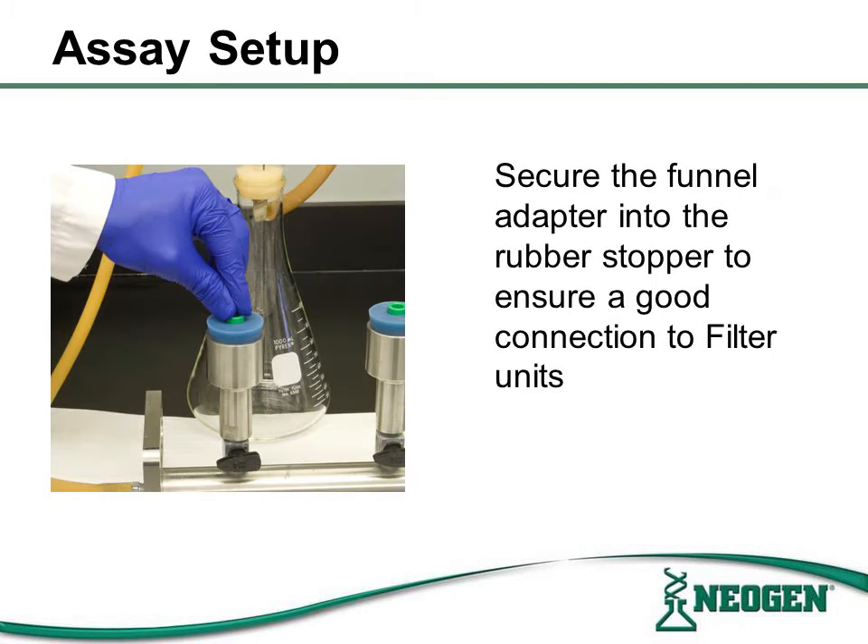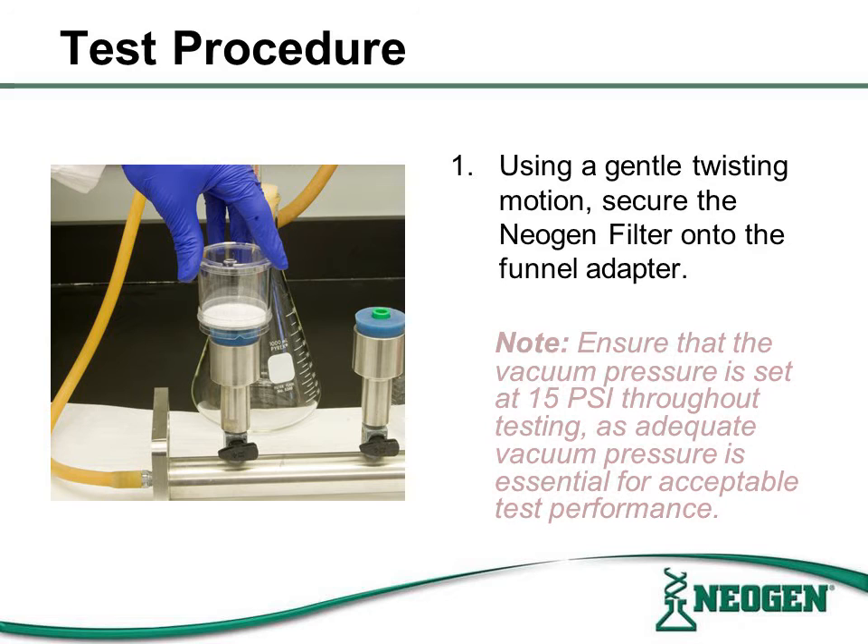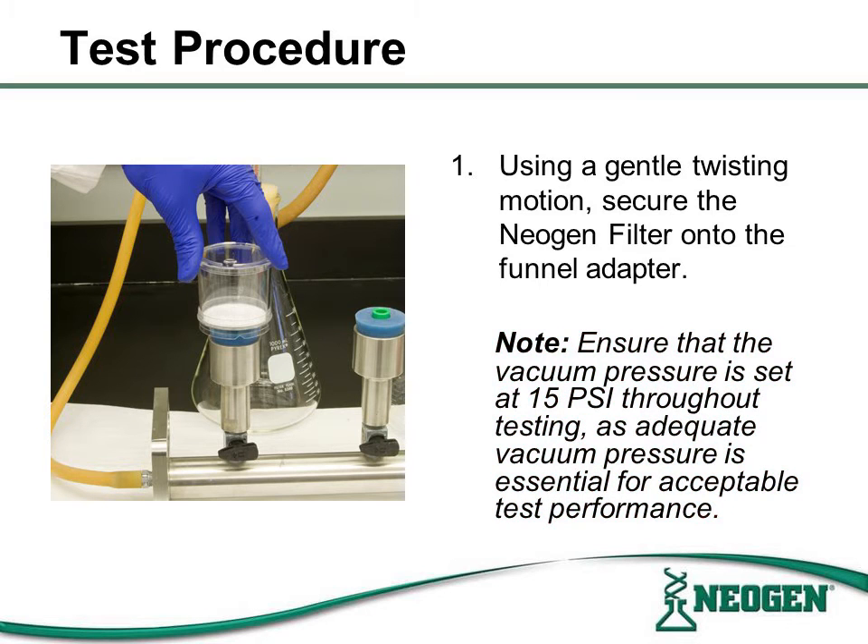Once the rubber stopper is secure in the manifold, place the funnel adapter into the rubber stopper, also ensuring a secure seal is formed. Using a gentle twisting motion, secure the Neogen filter apparatus to the funnel adapter. Please note to check that the PSI level is set and maintained at 15 PSI throughout testing. Adequate vacuum pressure is essential for acceptable test performance.